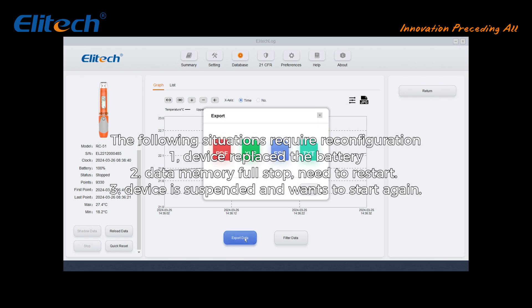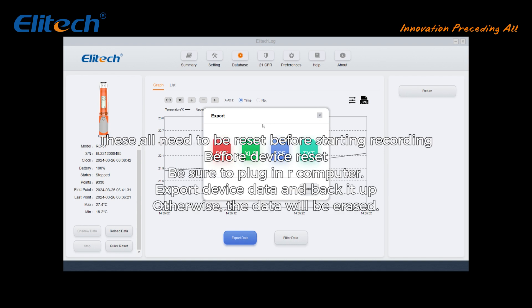The following situations require reconfiguration: one, the device has replaced the battery; two, data memory is full and you need to restart; three, the device is suspended and you want to start again. All of these require a reset before starting recording. Before resetting the device, be sure to plug it into the computer, export the device data, and back it up — otherwise the data will be erased.